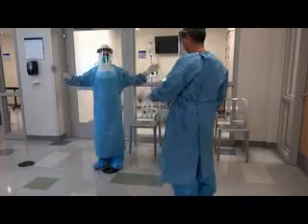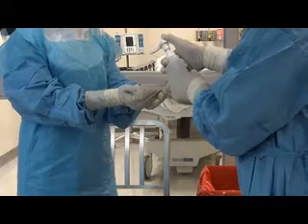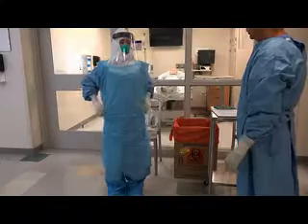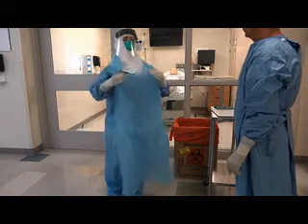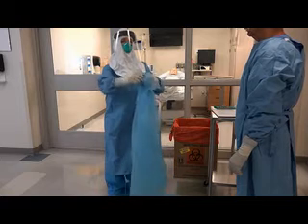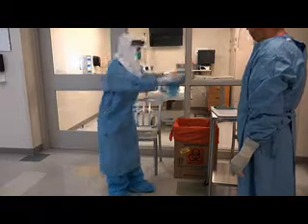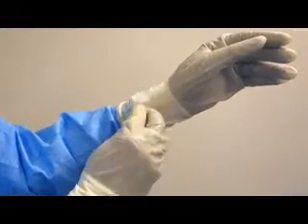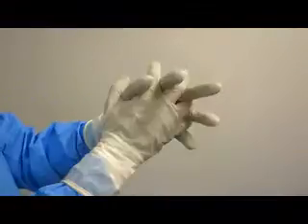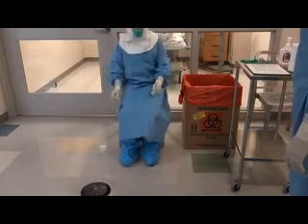Once in the anteroom, conduct another inspection of your PPE and disinfect any visible contamination with a disinfectant wipe. Disinfect your gloves. If wearing an apron, break the strap behind your back. Break the strap that is securing the apron around your neck and pull the apron away from your body, rolling it inside out. Discard it in the biohazardous waste container. Inspect your PPE again for visible contamination or tears. If visual contamination remains, wipe the area again with a disinfectant wipe. Disinfect your gloves.